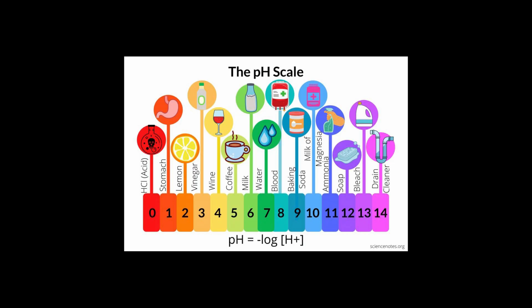The next thing I needed to decide was the aging procedure. Naively, initially I thought that I could just dishwash some of these glasses many times and then record the degradation over time, because many times I went to restaurants and saw that they have very degraded glasses. But this didn't work. After somewhere between 50 and 100 washes with the dishwasher, I still couldn't see any degradation. So I gave up on this.